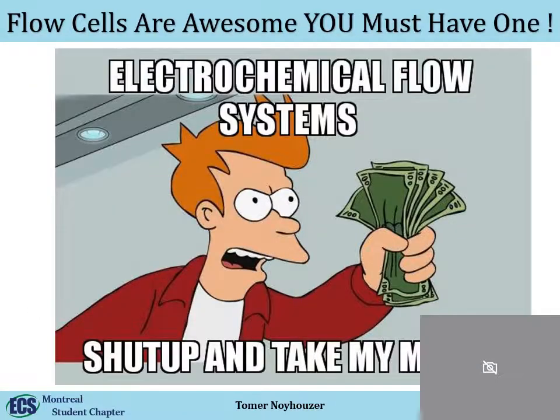Now, I hope I was able to convince you that flow cells are awesome and you must have one. I do believe they are the future for online monitoring and remote sensing, because they're much more sensitive, much more reliable and inexpensive compared to the spectroscopical systems that are widely used.